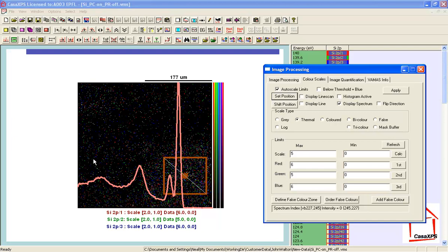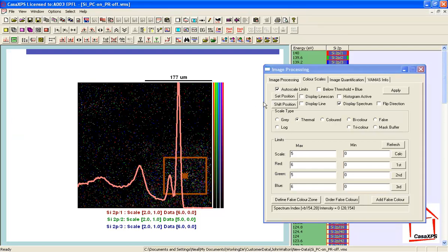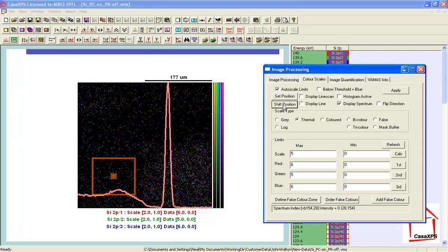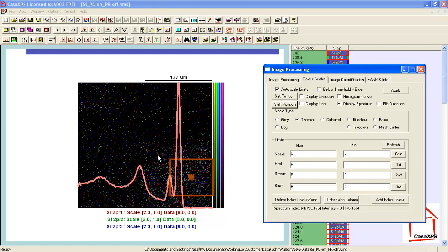Now if we move to a different position — I've clicked with the mouse and I'm going to press shift position — the box moves and now I have an area of the sample which, when I integrate all of these pixels, gives a spectral shape typical of silicon dioxide: a single peak with a relatively flat background and a broad response for this silicon peak. This illustrates that we have within this sample both silicon oxide and thin films of silicon oxide on elemental silicon.